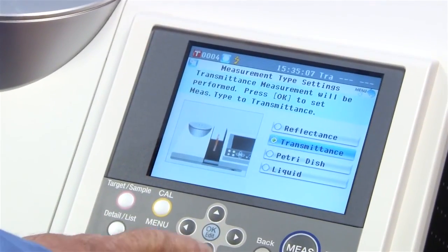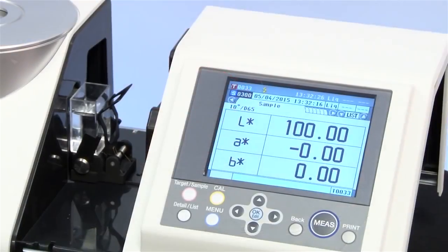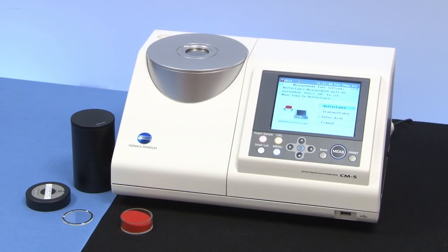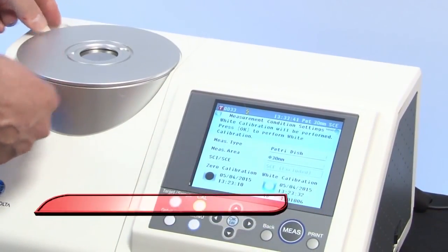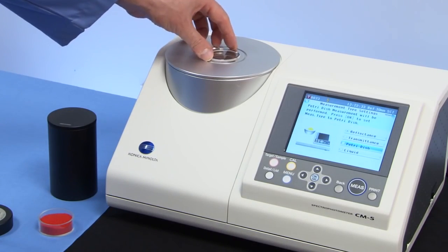Quickly switch various modes in reflectance or transmittance including petri dish and liquid. Configure the CM5 to your measurement requirements. To perform a reflectance measurement in petri dish mode, put the special target mask in place, followed by the glass accessory piece.